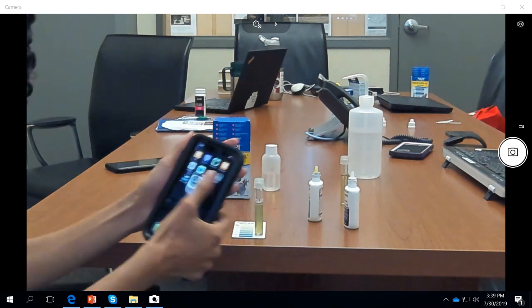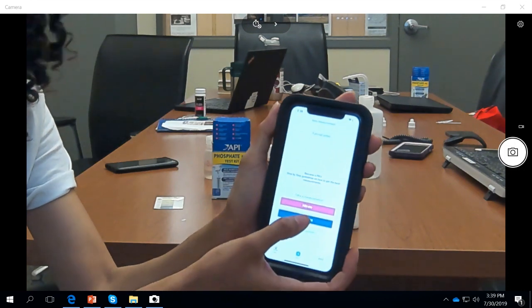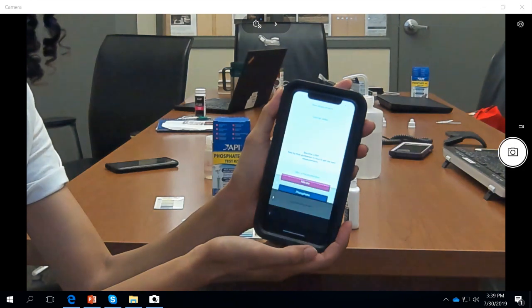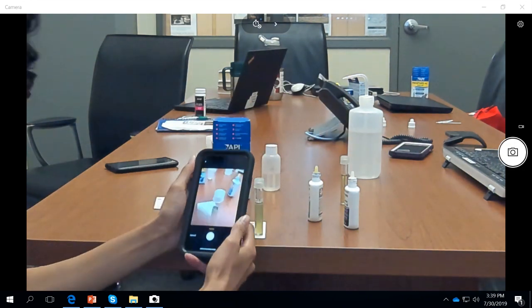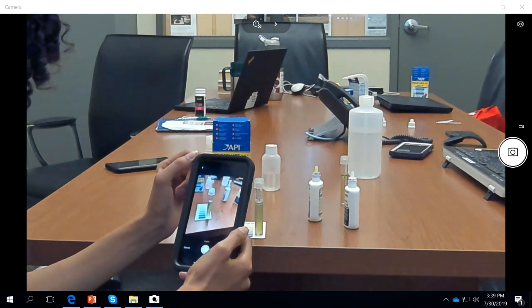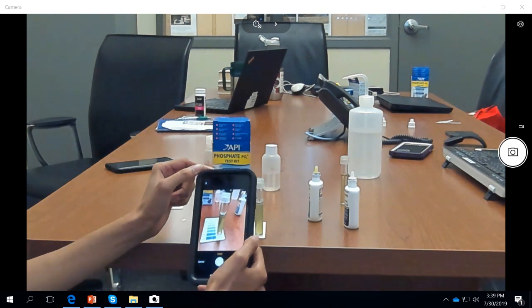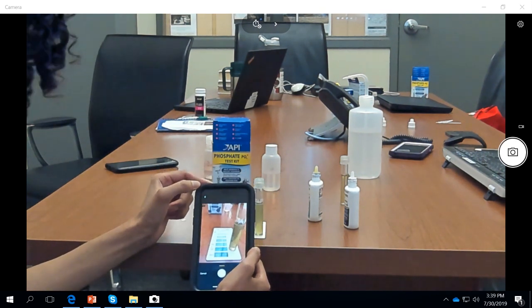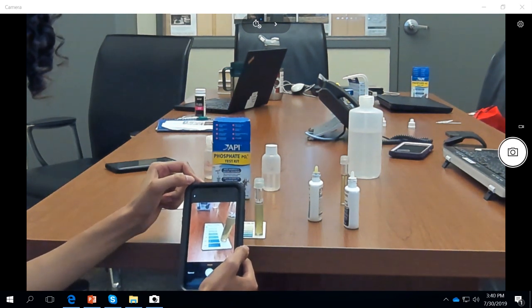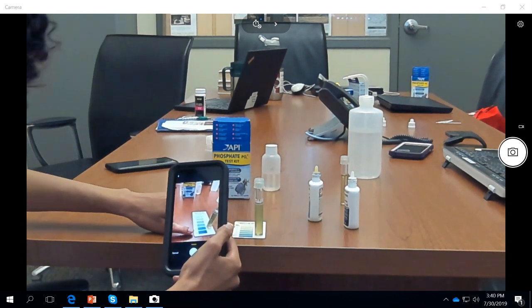Open the app, and on the app, select Phosphate. To take an image, select Camera. Be careful not to include any shadows, stripes, or reflections on the reference card or the test vial when taking the image. So attempt to get as close as possible to include the vial and all the reference colors while not including any shadows or reflections or stripes on top of the reference colors.